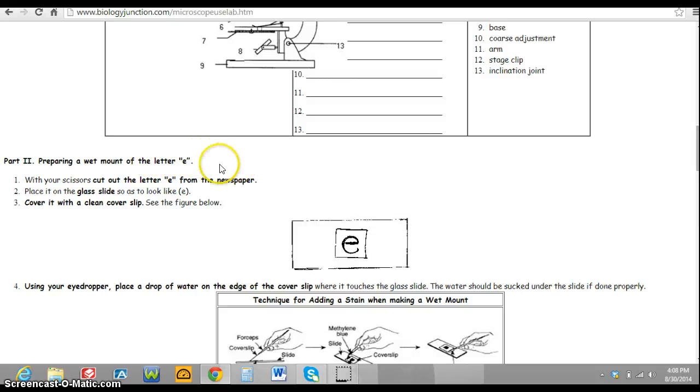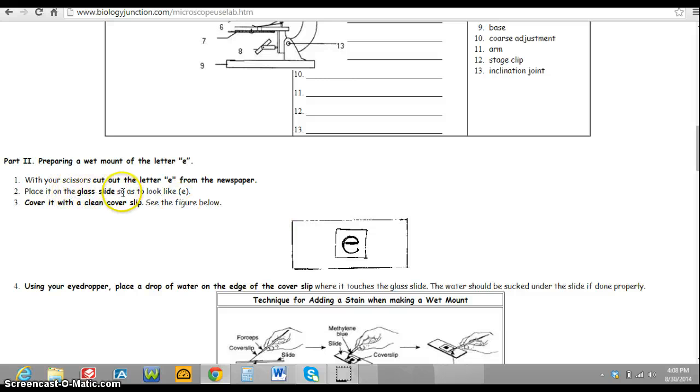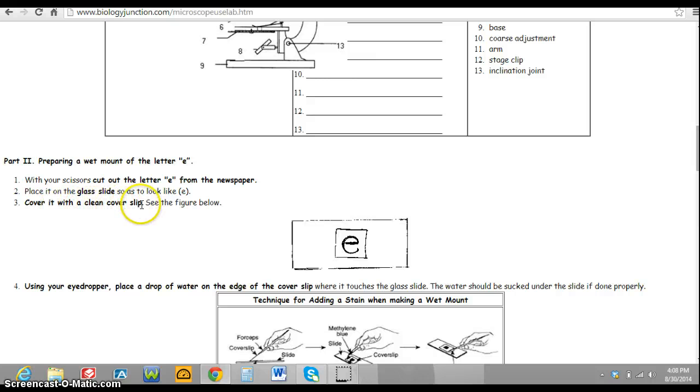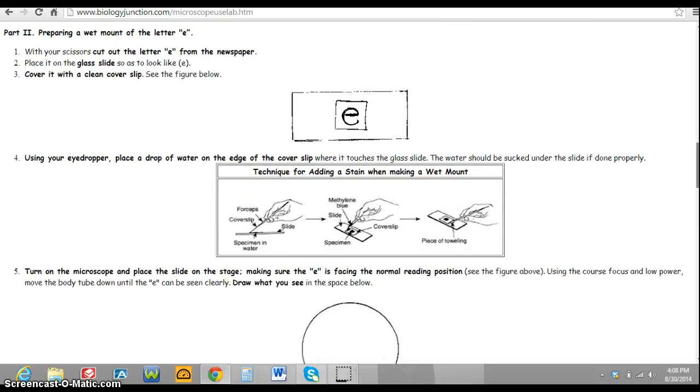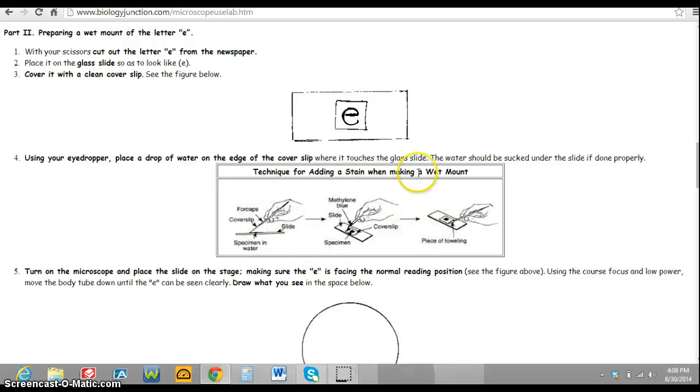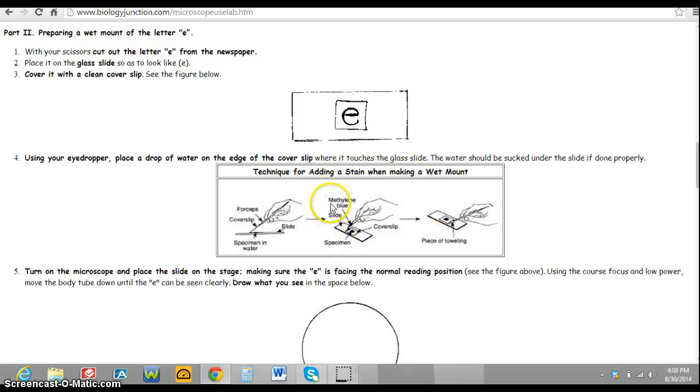The next part of the procedure you need is the following: to prepare a wet mount of the letter E, you will need to cut out the letter E, place it on the glass slide to where it looks like E, cover it with a clean cover slip. And in order to do it with a cover slip, you might want to do this diagram in your lab notebook or something similar.